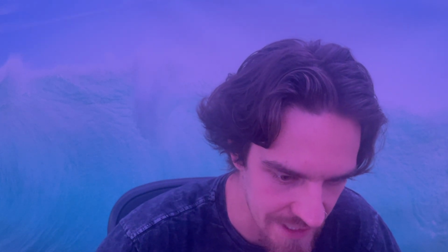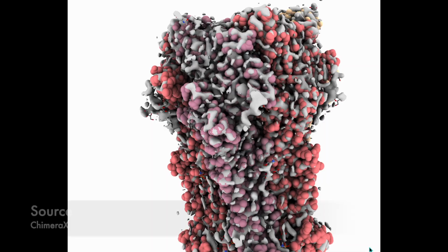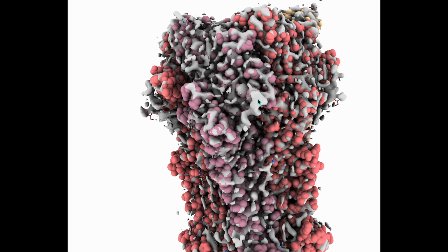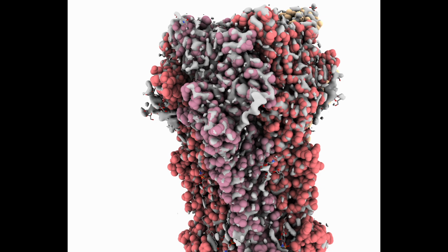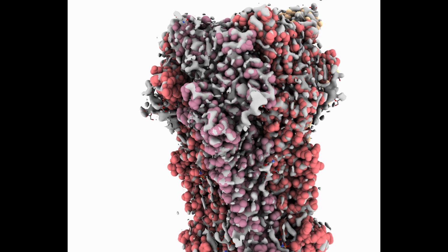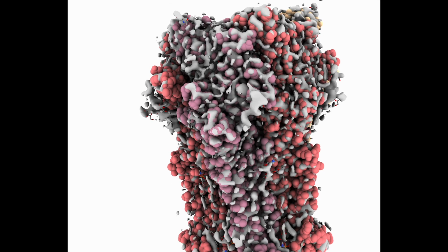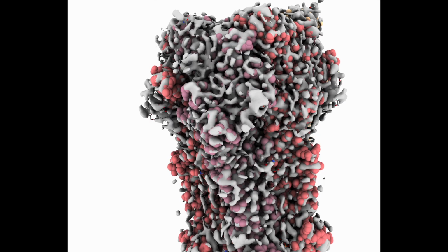And so now, looking at, I have to pull this up real quick, so give me one second. But yeah, looking at this video here, what we can see is my cursor going around that point where the toxin is. I'm going from a high density to now a lower density map, looking at the less dense regions. You can see I'm circling the toxin, which showed up as the lower density region since it's more mobile. Down at the bottom there, we have the nanodisk, which you can see those lipids, and I also pointed out a sugar that's up at the top there.